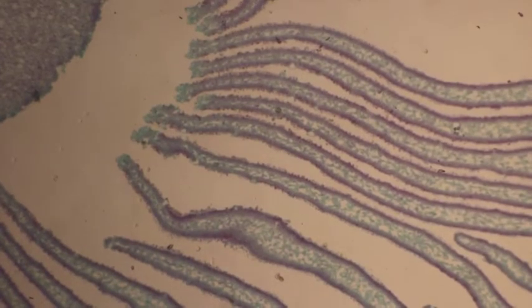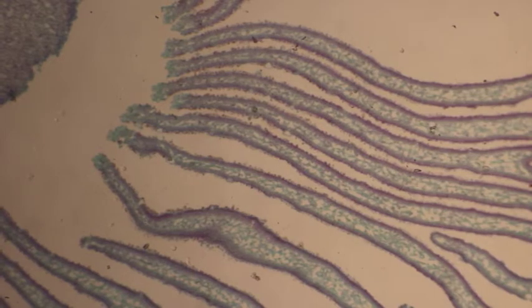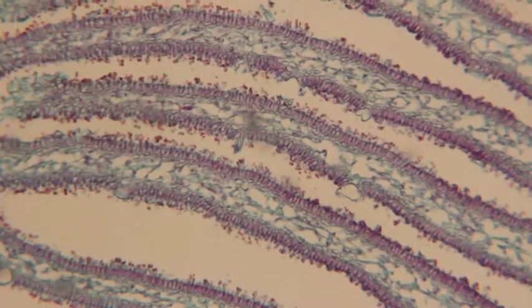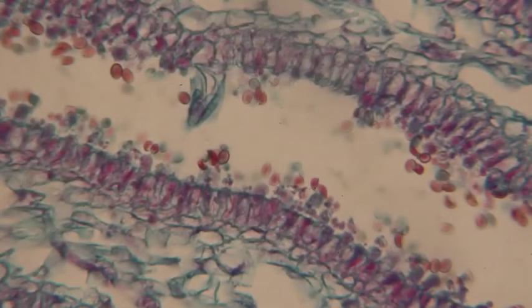There you can see those have a little bit more reddish tinge to those gills — those actually have more spores. We'll go up under the 10x magnification. A lot of spores here. This is a Basidiomycota, so the key thing we're looking for is a basidium — a single cell that is going to have four spores attached.